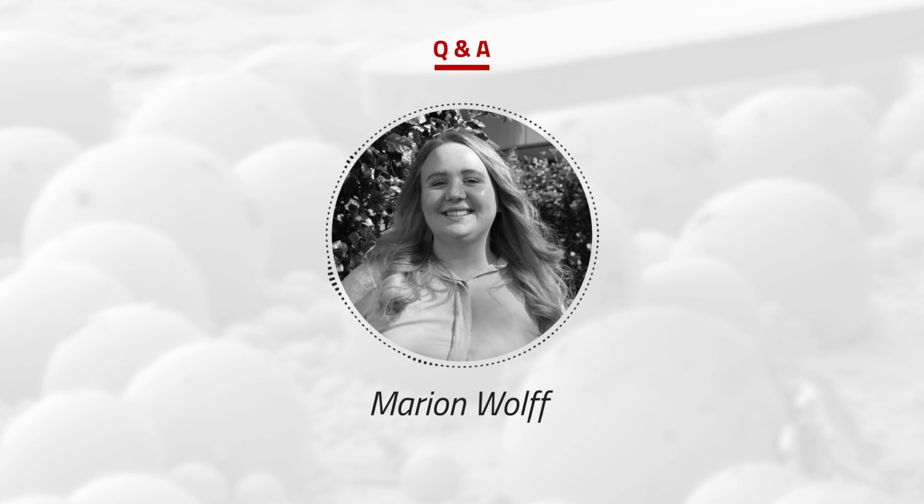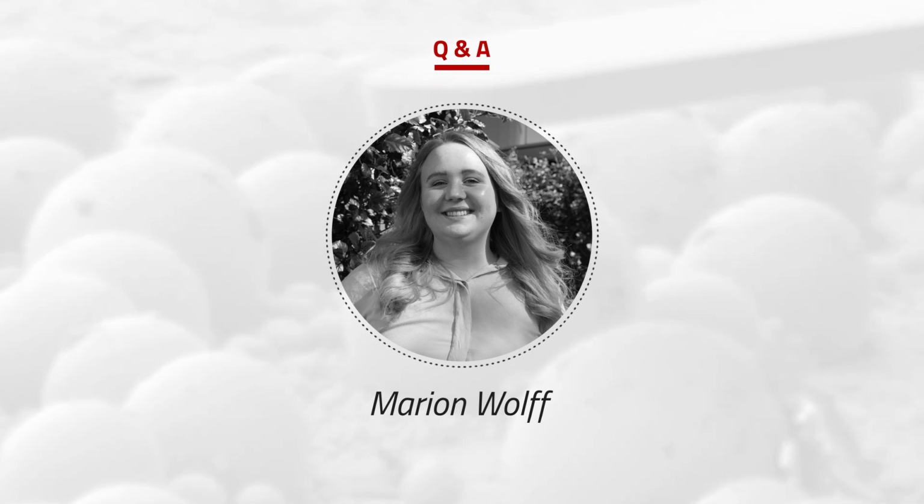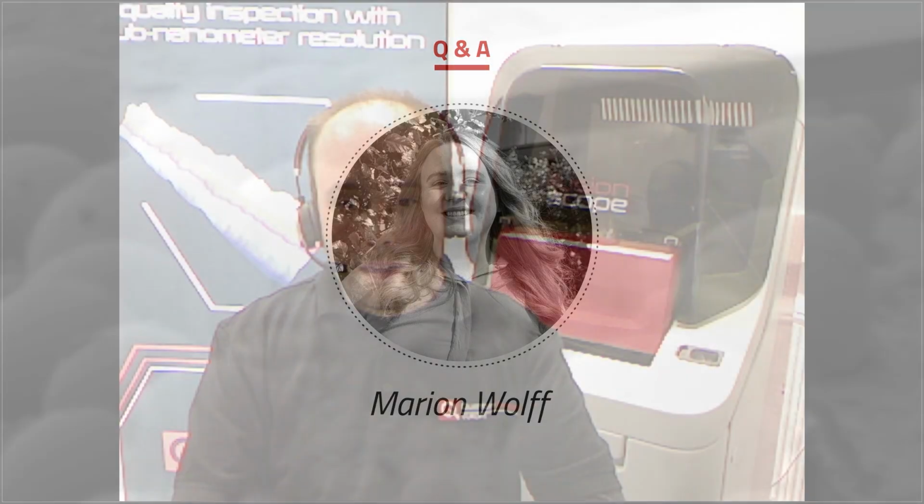Good, as we are anyway having another question and answer session at the end, I think that we will now move on to the lab, where our colleague Lucas will show you more hands-on how to perform measurements with the FusionScope.